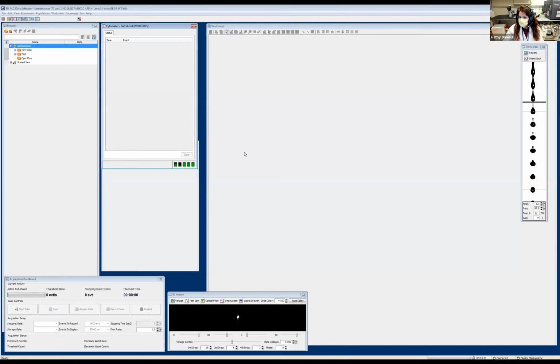Thank you so much, Derek, for that awesome introduction. So I'm going to go ahead and start sharing my screen here. And do we all see the Diva software now? Showing up? Okay, perfect.